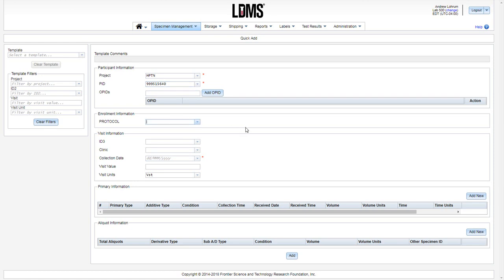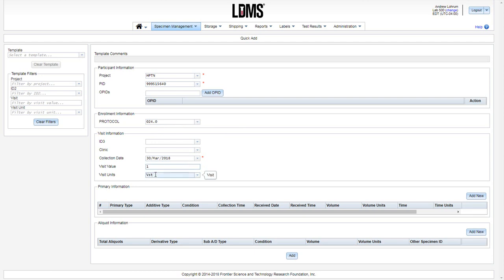Move to the enrollment information and enter in the protocol. Click once on the date and it is then entered into the field. Continue with the visit value and our visit unit was entered for us.